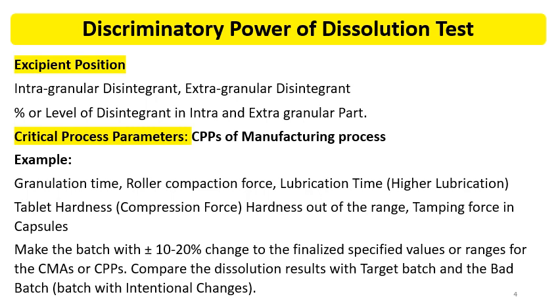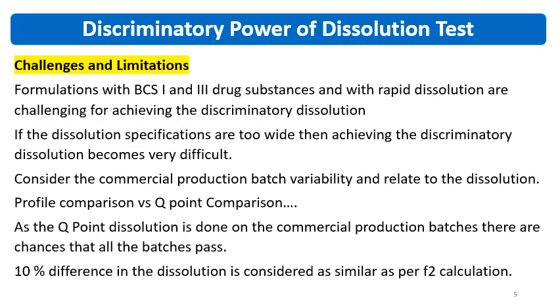The bad batch is the batch with intentional changes, and then you will know whether the dissolution test is discriminatory or not. See, some challenges and limitations are there for discriminatory power demonstration. Formulations with BCS class 1 and 3 drug substances and with rapid dissolution are challenging for achieving discriminatory dissolution.